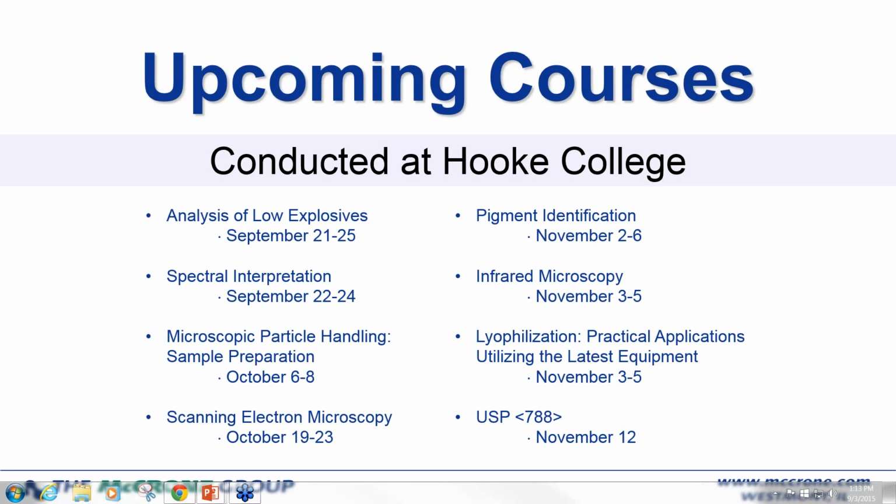What other tests would you use to confirm the presence of silica? To confirm silica, I would send it on for EDS to confirm that we had silicon as an element present. My colleagues are welcome to chime in with anything they may. They're giving us the thumbs up.